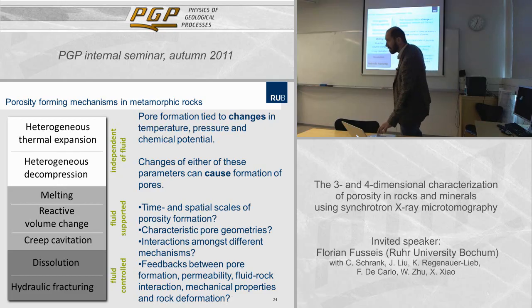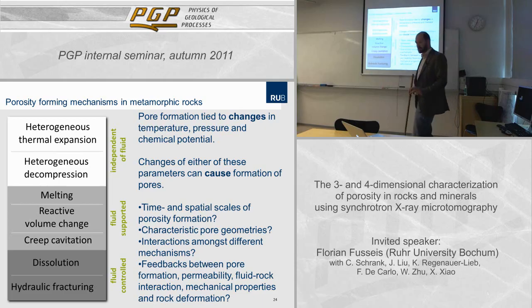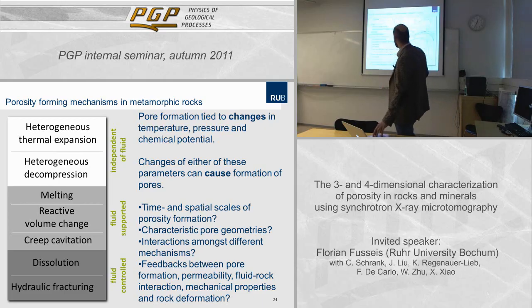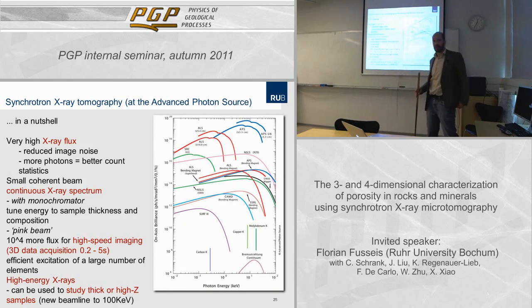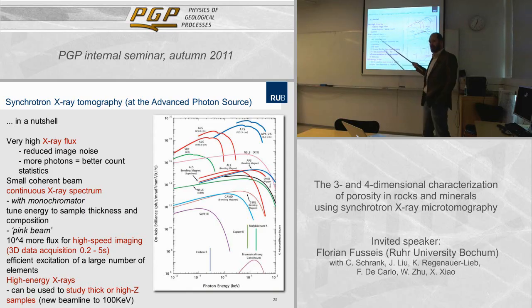Before that, I'm going to show you some results from four-dimensional experiments, time series experiments that we conducted. I want to show you a little bit more why synchrotron tomography is absolutely superior to any normal X-ray tomography. In fact, the results that I'm going to show you are only possible because we have these tools available.